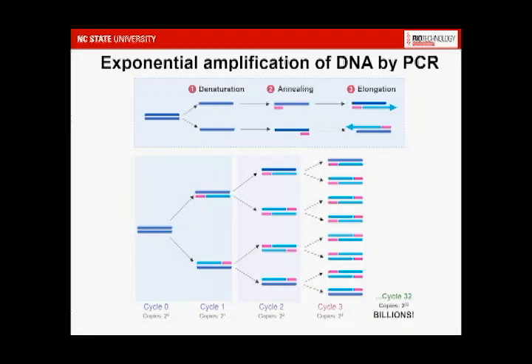So what about the chain reaction part of PCR? Each cycle, the DNA sequence located between 2 primers is replicated. The new products can become template for the next cycle, enabling exponential amplification of the PCR product, at least until reaction components are used up. Under ideal conditions, a single copy of template DNA can be amplified into 1 billion DNA molecules by PCR.